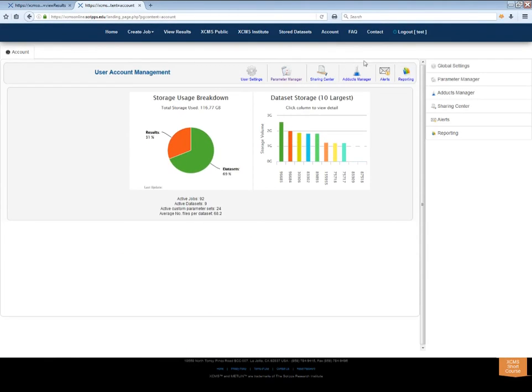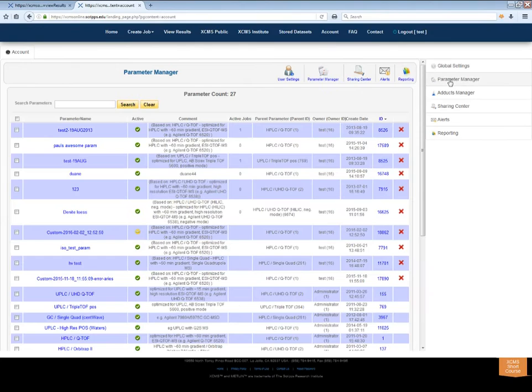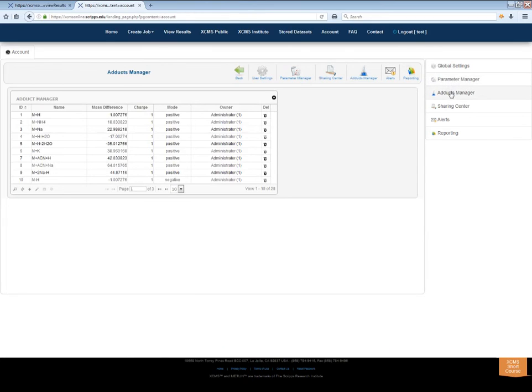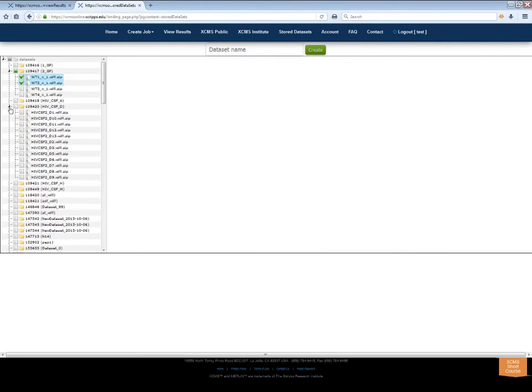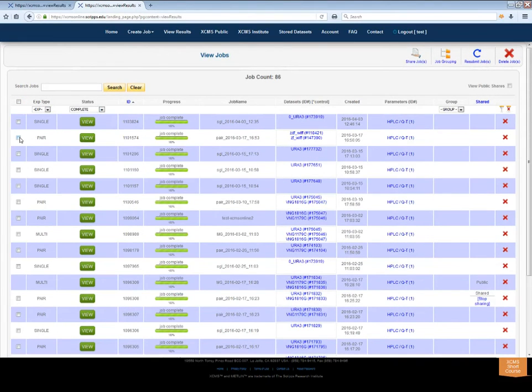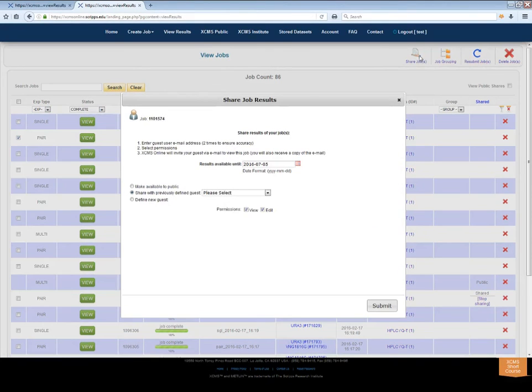XCMS Online allows you to create custom parameters and adducts, mix and match data into unique datasets for experiments, and share data publicly or privately with other XCMS users.